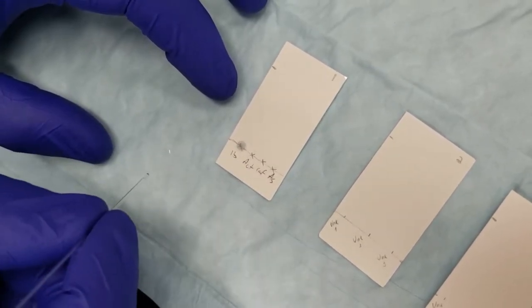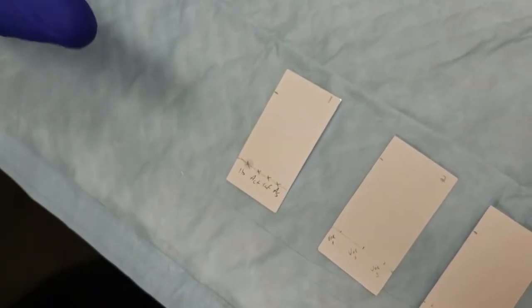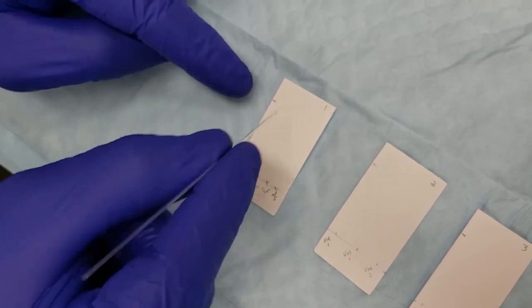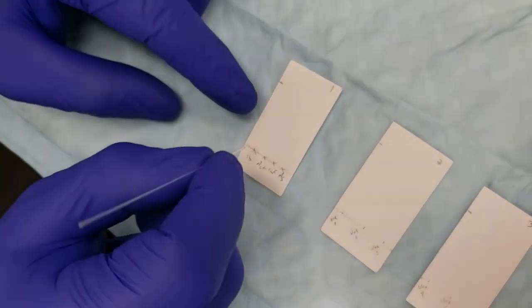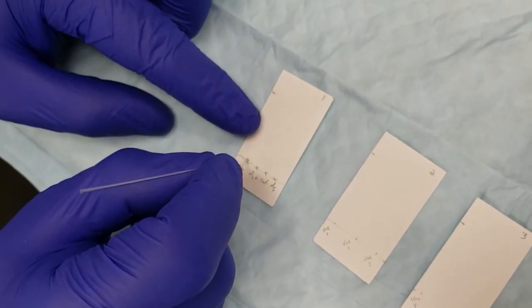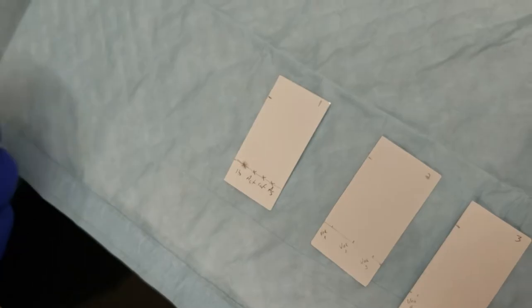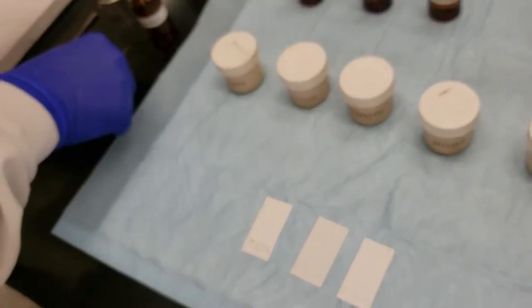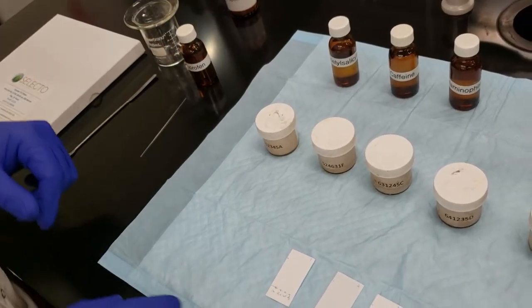The larger the diameter of that spot, the larger the diameter of the spot that we're going to see on our TLC plate. We're going to have a blurred or smeared spot, so we've got to try and keep this as contained as possible. And there we go. Now I'm going to take that spotter and set it aside, and I'll set my ibuprofen aside as well. I don't want to mix any of these things up.